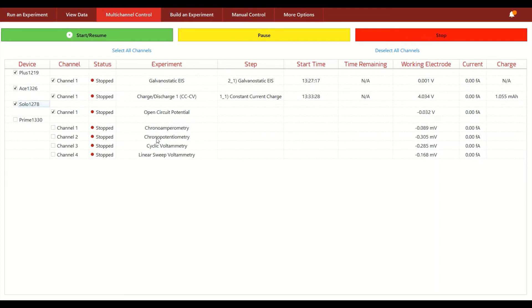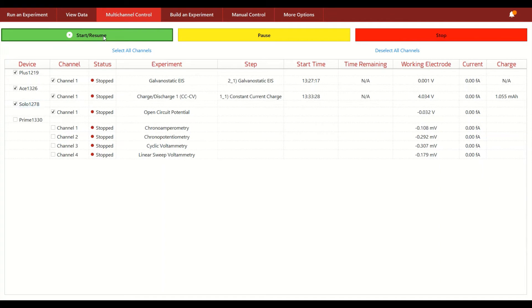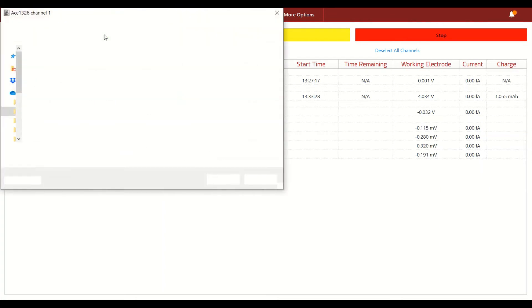So once you've determined which channels you want to have run various experiments, you can start all the different channels by hitting the start button.